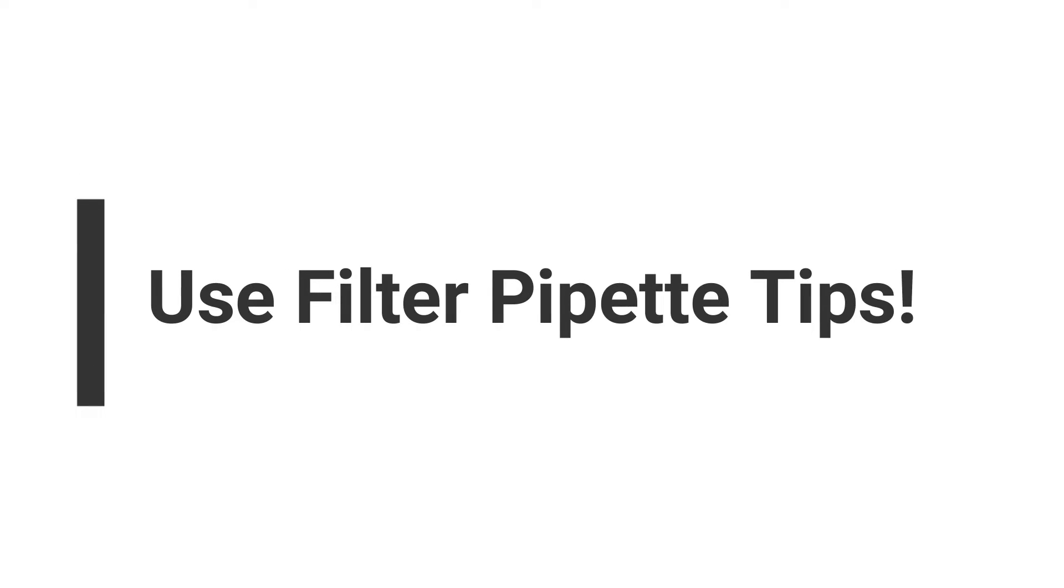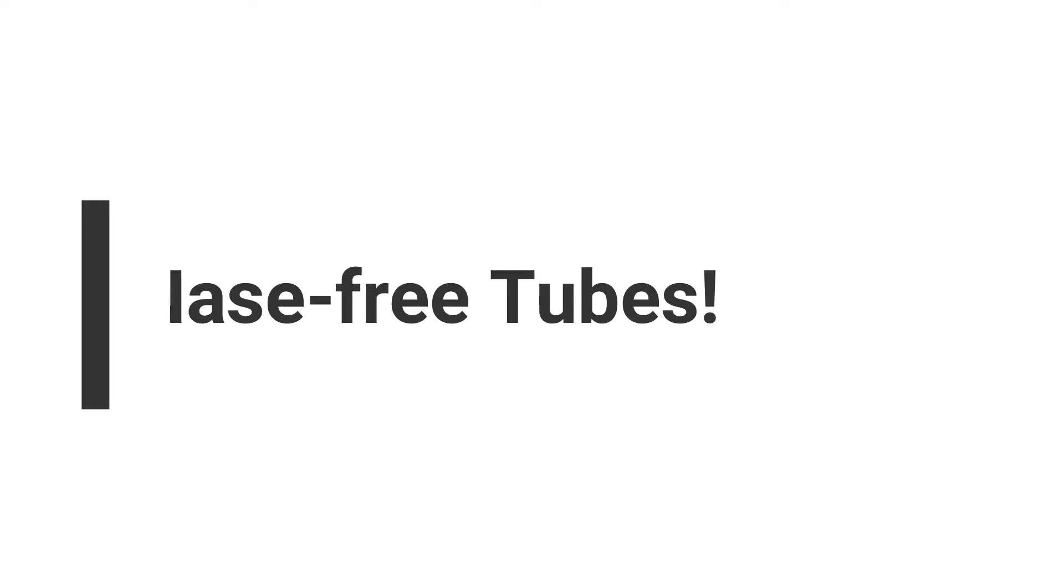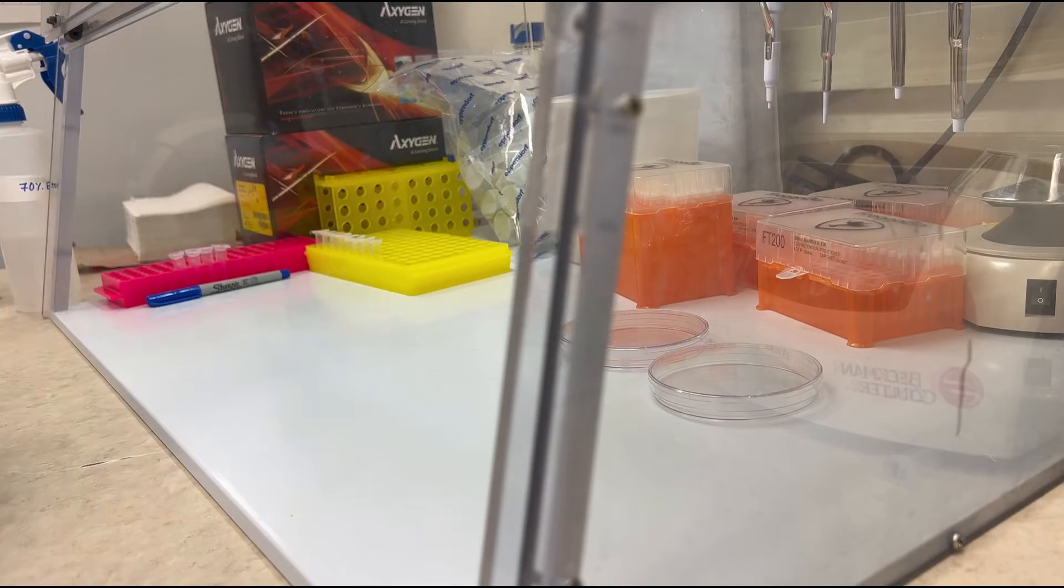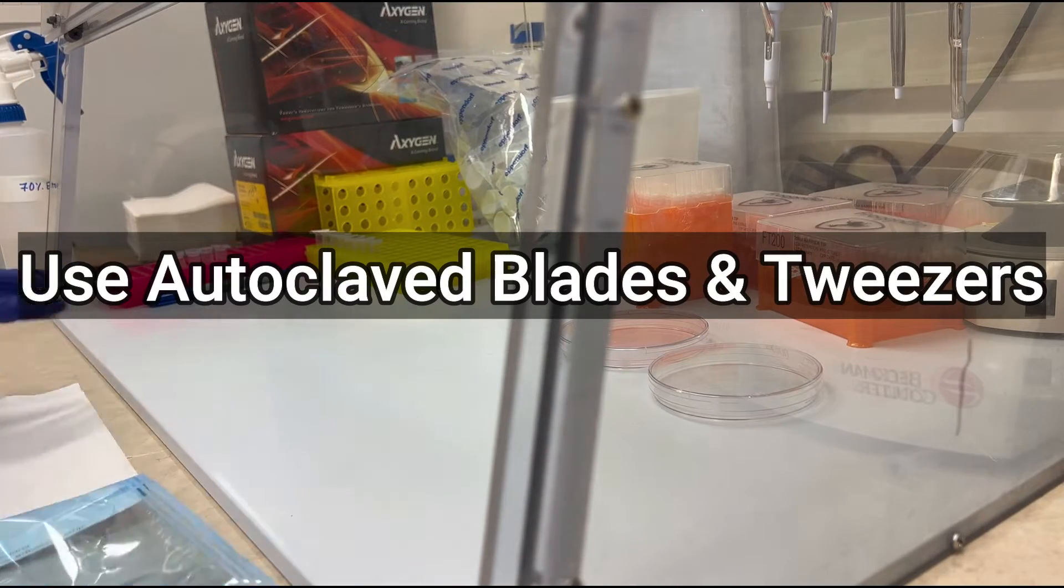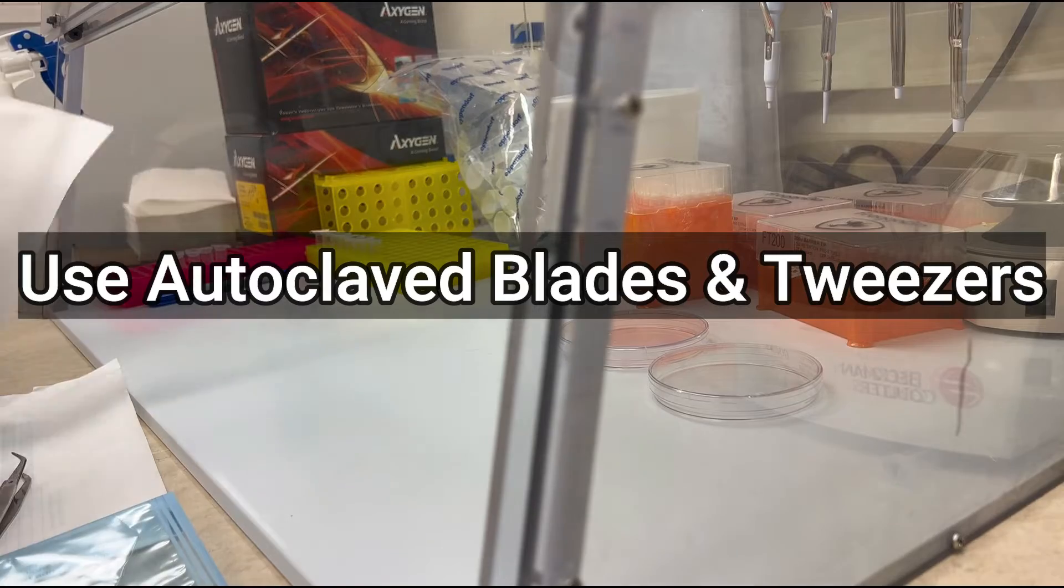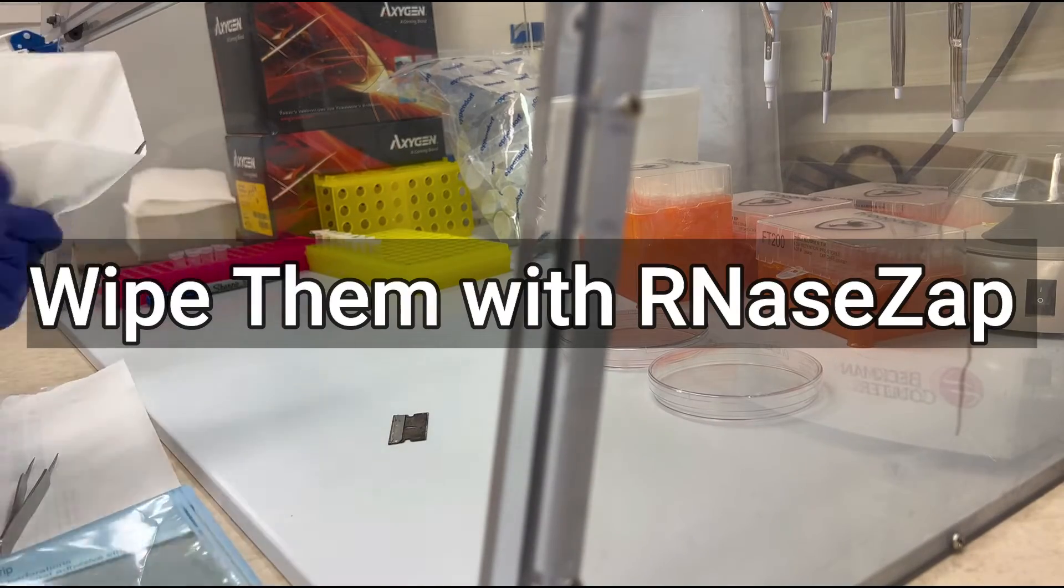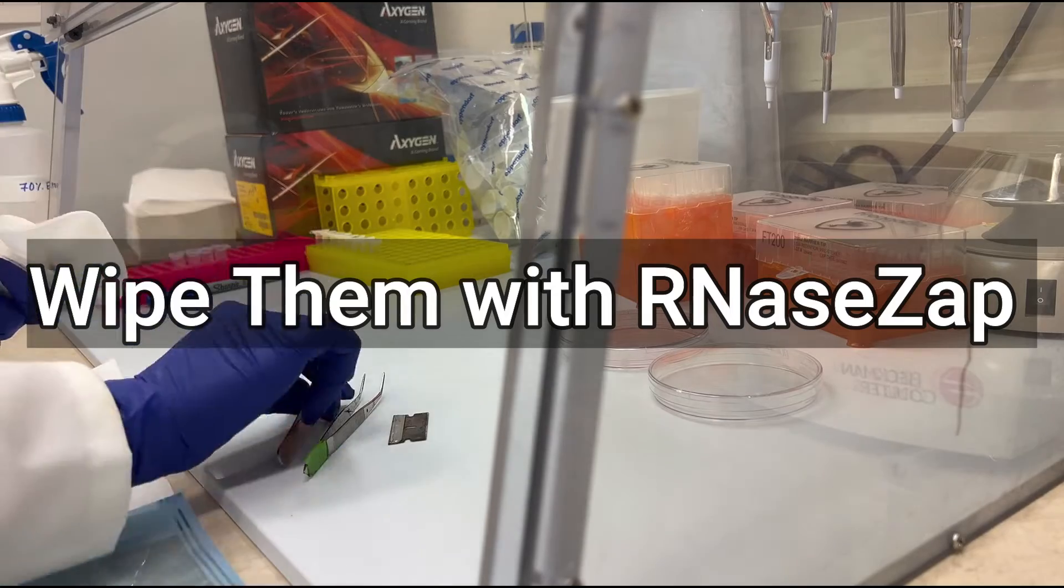Next up, use filter pipette tips. It may seem small, but they play a big role in preventing contamination. Use RNase-free tubes; these special tubes are essential to keep your RNA samples intact. To ensure the integrity of your samples, use autoclaved blades and tweezers, but wait—there's one more step: wipe them down with RNA zap before you start.